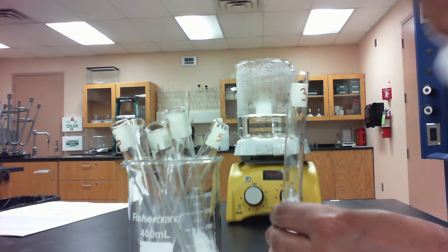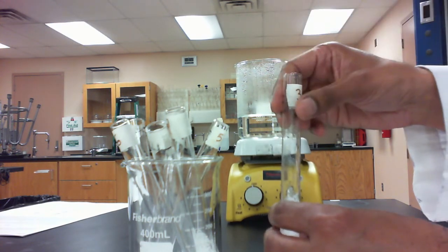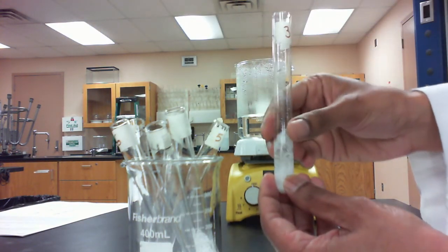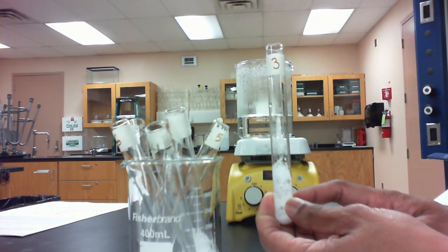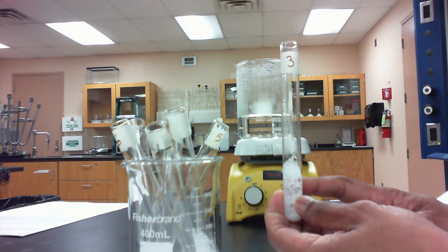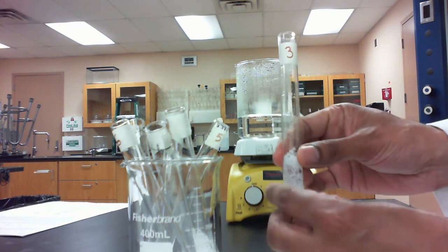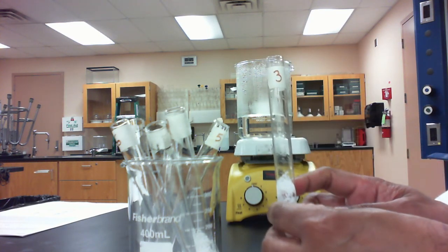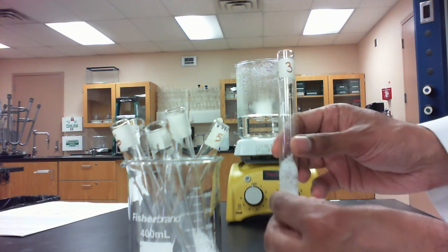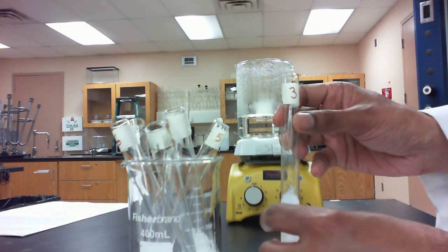You're going to try to describe that smell or scent. I can tell you right now that test tube 3 smells a little bit minty. This is where having smell-o-vision would have been very helpful, because obviously you cannot smell what I'm smelling. Your instructor will provide guidelines as to how to give you the data for the scent of these esters.